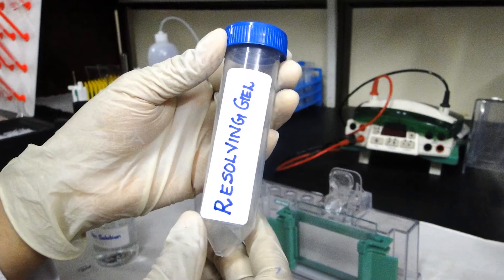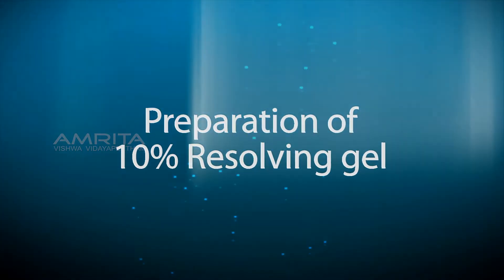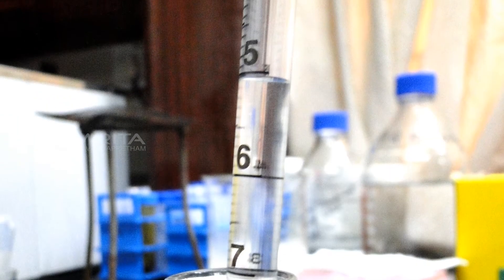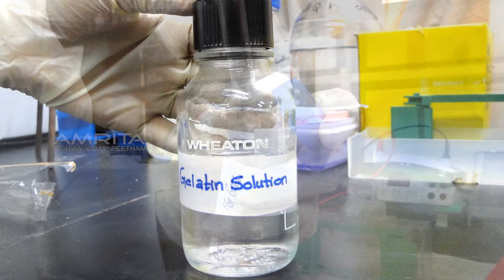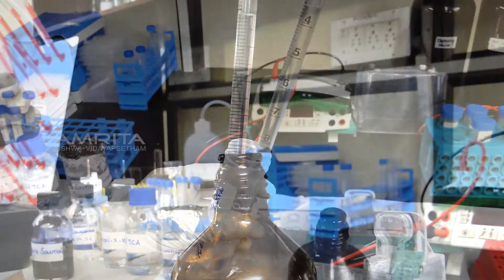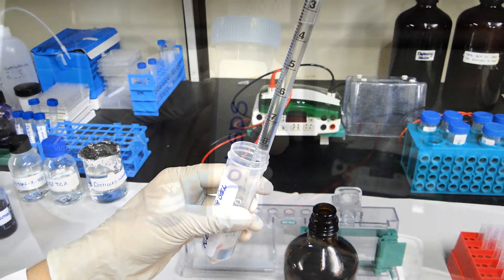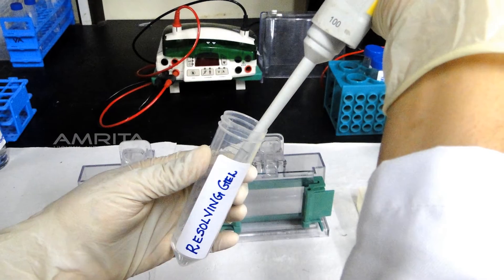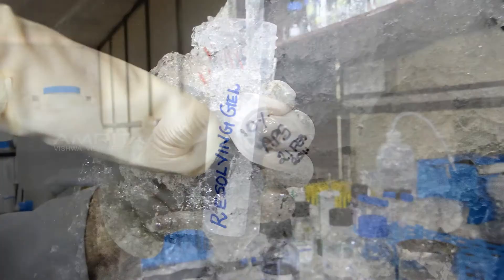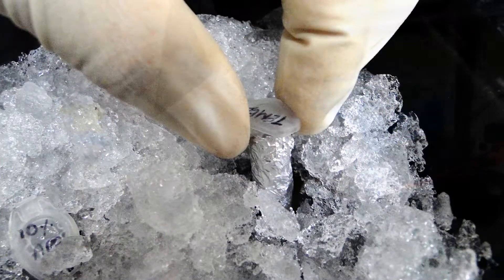Take a blue capped tube and label it as resolving gel. Preparation of 10% resolving gel: The reagents used are 5 ml of gelatin solution made in 1.5 molar Tris of pH 8.8, 3.5 ml of 30% acrylamide-bisacrylamide mixture, 82.5 microliters of 10% SDS, 82.5 microliters of 50% glycerol, 100 microliters of ammonium persulfate or APS, and 10 microliters of TEMED which should be kept in an icebox.